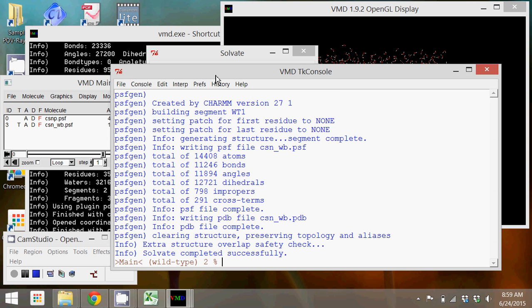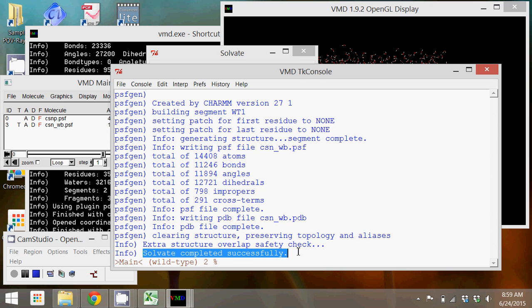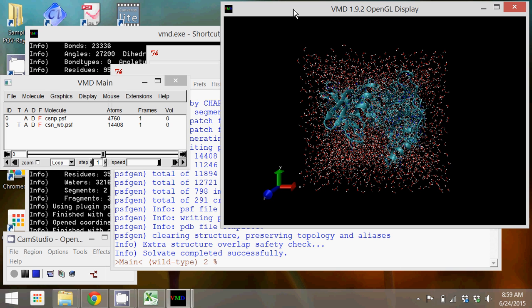You'll notice that there are now two structures loaded, one being your new solvated enzyme. What I will do is delete the one we started with and then I will create a representation so that it's clear the water from the enzyme.